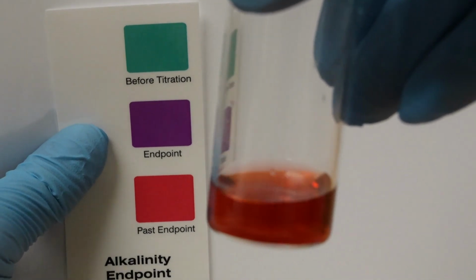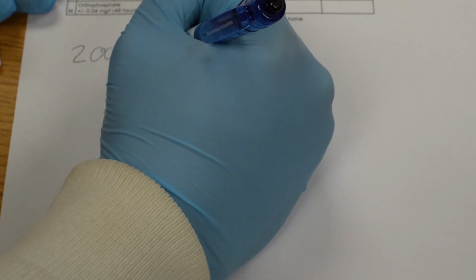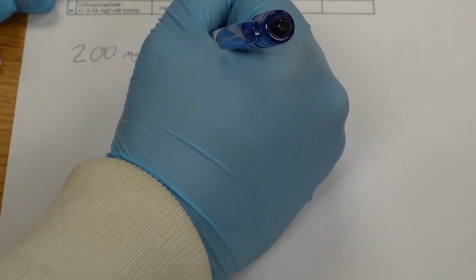If you use all the reagent in the titrator syringe, you can refill the titrator by following the same process in step 3, but be sure to account for all reagent used when recording your results on your datasheet. Do this by adding 200 mg per liter to the second reading.